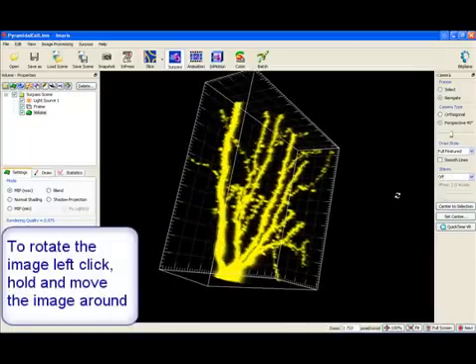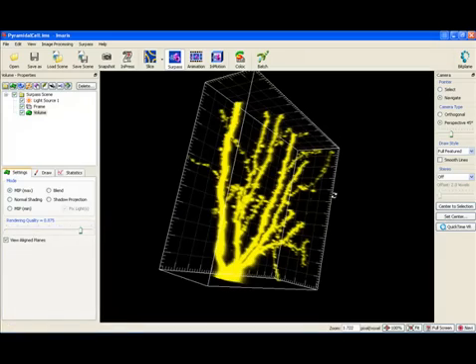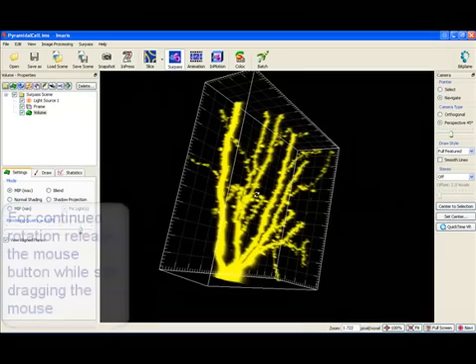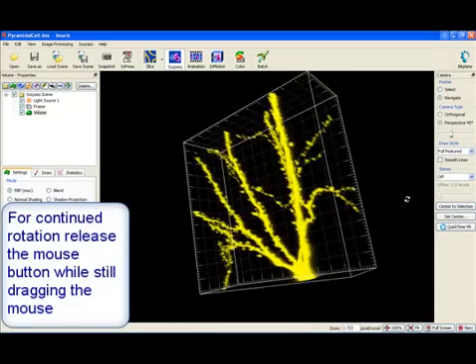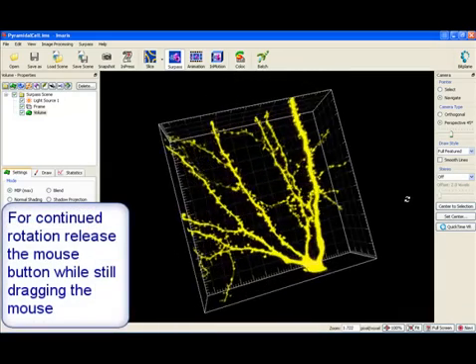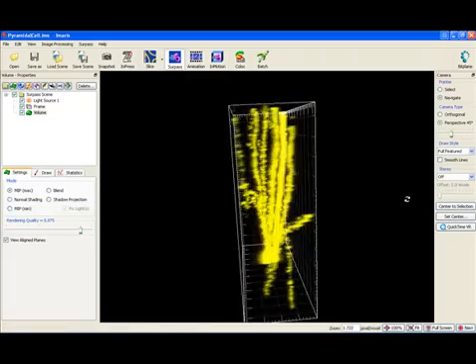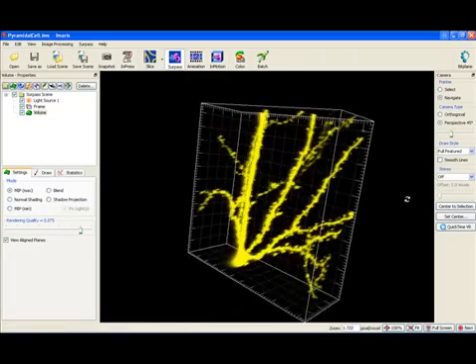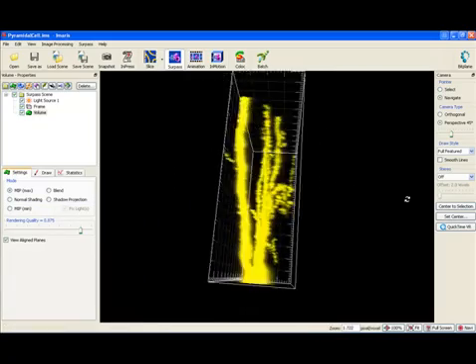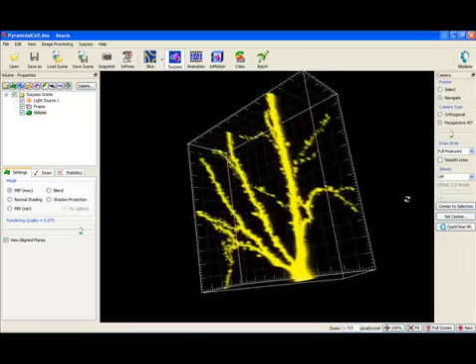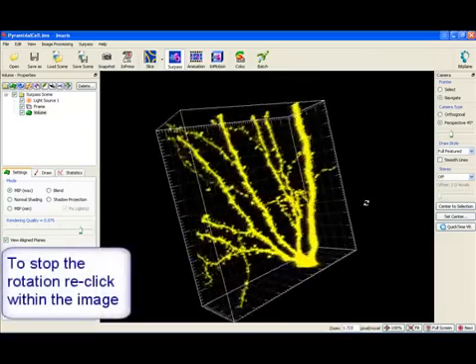For continued rotation move and release the mouse in one motion. Clicking on the image will stop the rotation.